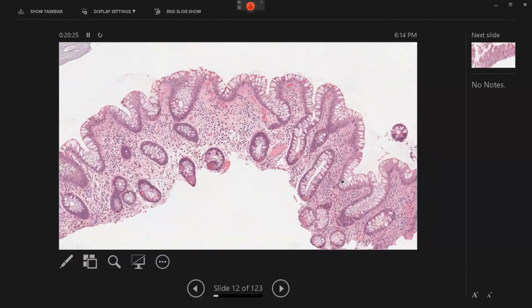Let's move on. So this is another example, another case, and what you are able to see as well, you might look into these inflammatory cells and say, well, I don't feel that there is a significant increase in the inflammatory process. There is no increase in lymphoplasmacytic inflammatory cell infiltrate, and there isn't anything acute.